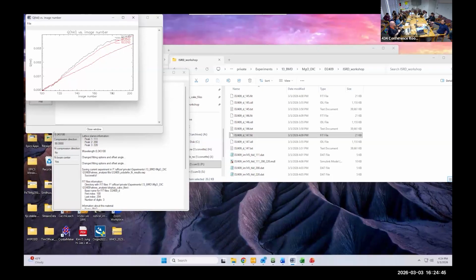And all of the assumptions and all of these calculations have to remove that in order to make the calculation feasible. Even for a single phase, Pam showed that 10 peaks for olivine. What if you use 5? What results you get? If you use 7, what you get? So my guess is if you use different number of peaks, you'll be getting different results. And then the question is, how do you know you have enough sampling to represent the whole thing?